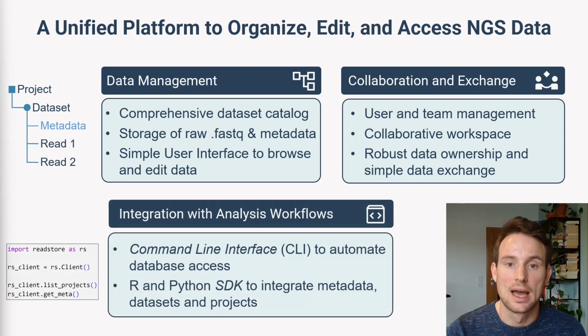And we would like to have an integrative command line interface that allows us to access the data platform programmatically, and also an SDK or API so that we can access the data platform from R or Python scripts and get the necessary information in order to automate our data analysis pipelines.